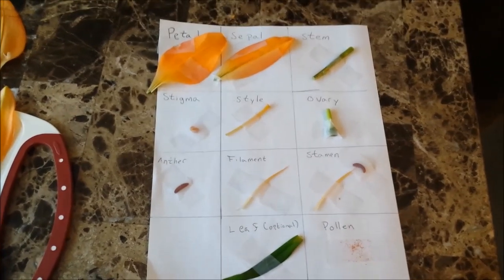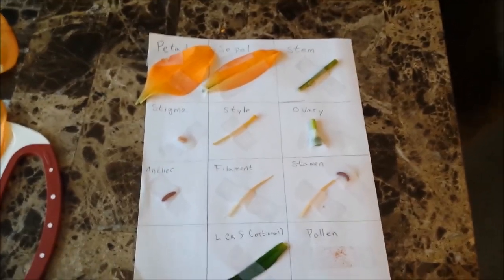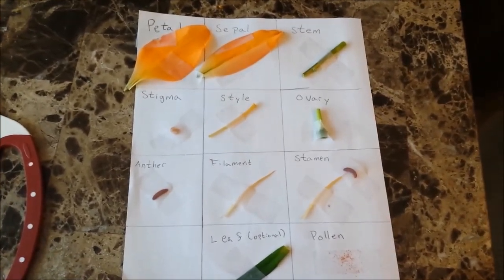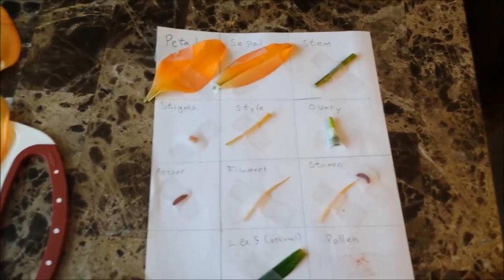Now that you have everything taped up onto your paper and you have everything complete, compare and contrast with other classmates and find out some of the differences, and then write them down on your question sheet.